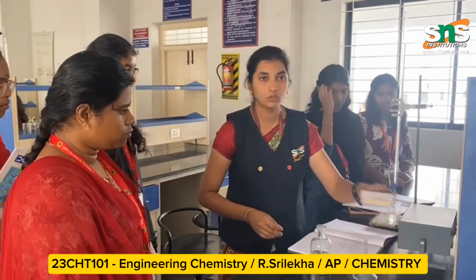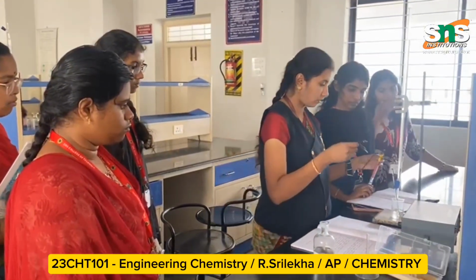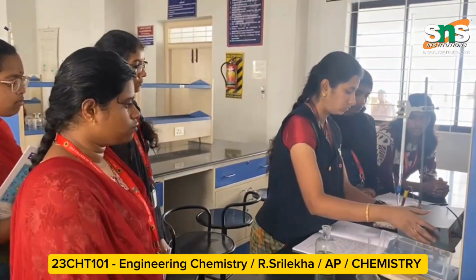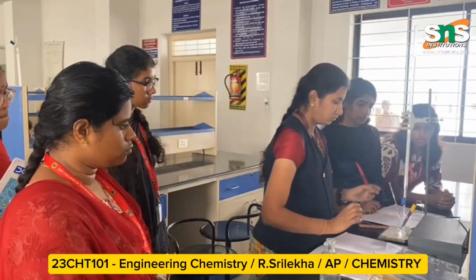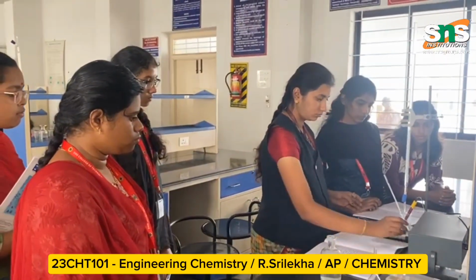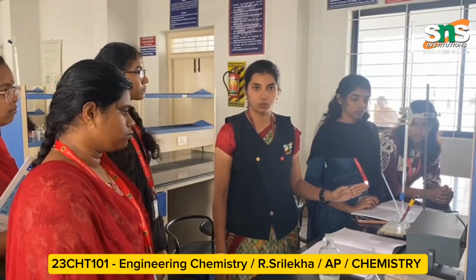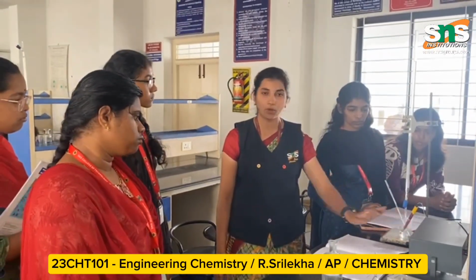Now I am adding the conductivity cell to measure the conductance of the solution. With 0 ml of the sodium hydroxide burette solution and 20 ml of the mixture of acids, the conductance value at 0 ml is 12.65.